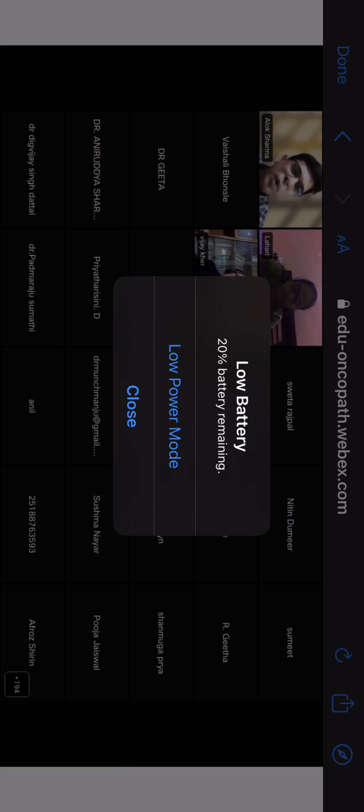So if you pay good attention and do a good Congo red stain, even the routine 3 to 4 micron sections are good enough to detect most of the amyloids. Of course, the thicker it is, the better visible it will be. But diagnostic accuracy won't go down if you use thin sections. Definitely.